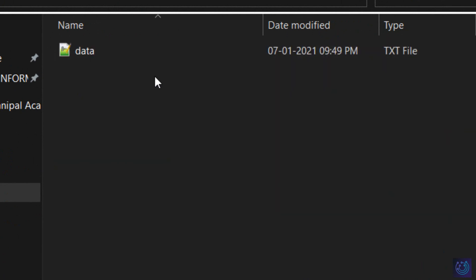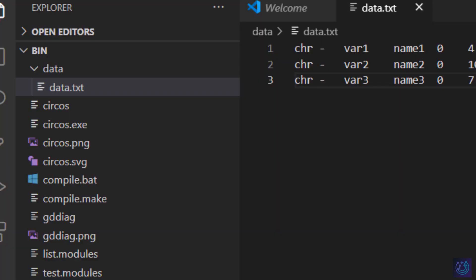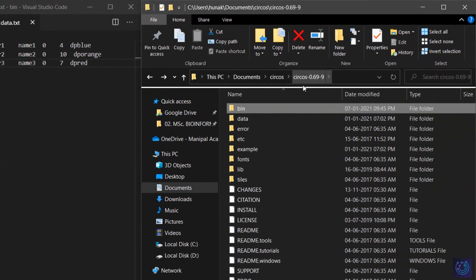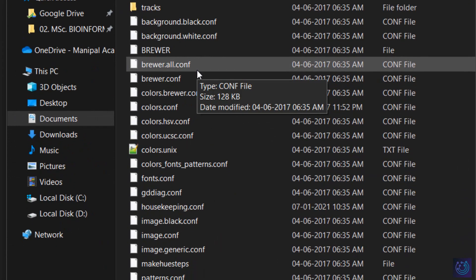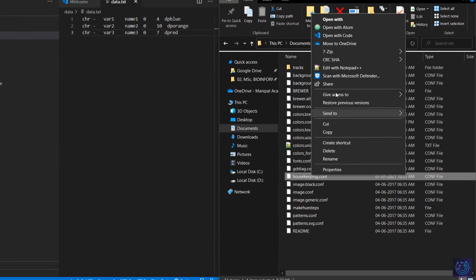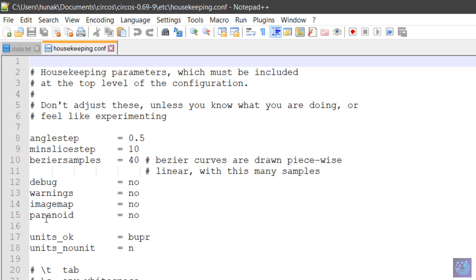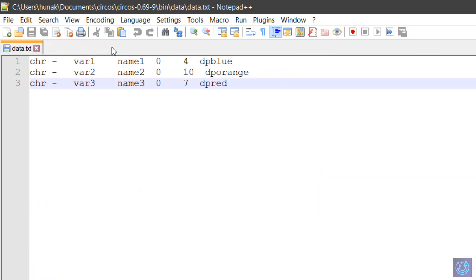In the data folder we now have a file named 'data.txt' with the chromosome or karyotype details. Next, we need to change a specific setting. Go back to the Circos folder, navigate to 'etc', and open 'housekeeping.conf'. From here we just have to change 'paranoid' from 'yes' to 'no'. Save this file before exiting.